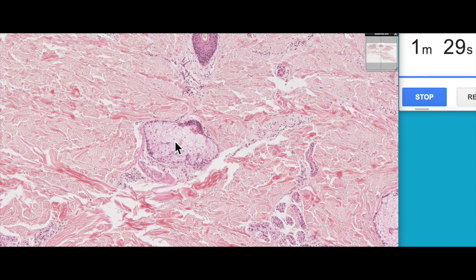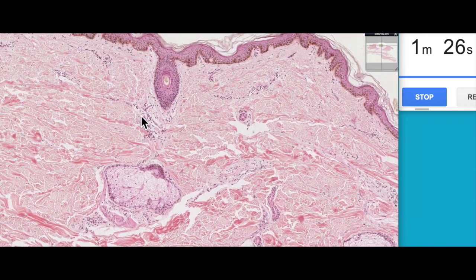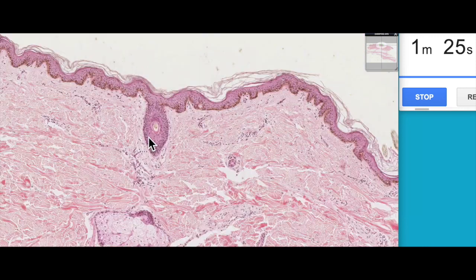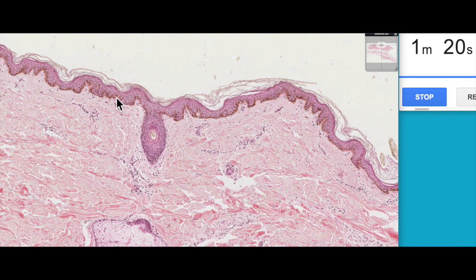This structure here is a sebaceous gland. Sebaceous glands secrete a substance called sebum — a lipid-based substance released next to the hair follicle that makes its way onto the surface and keeps your skin nice and soft.